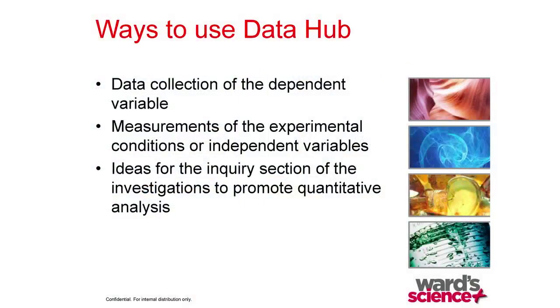Ways you can use the Datahub. We'll start with data collection of the dependent variables. In some cases you can actually measure what you want to measure. The second item is you can measure the independent variables, or what the environment is like at the time that you take the readings. And the third way is it gives you other ideas for how to stretch the inquiry section of the investigations.